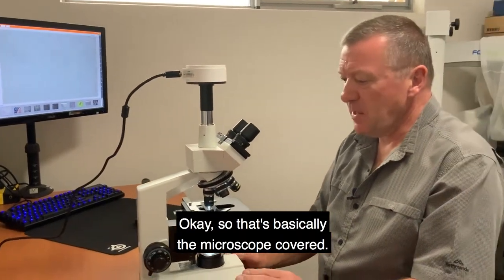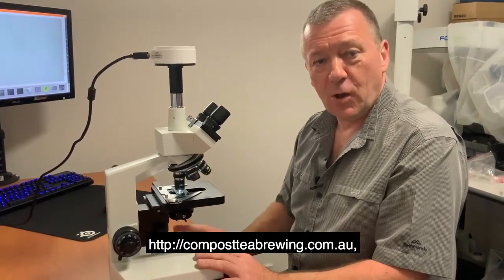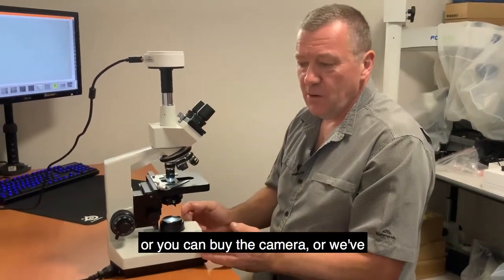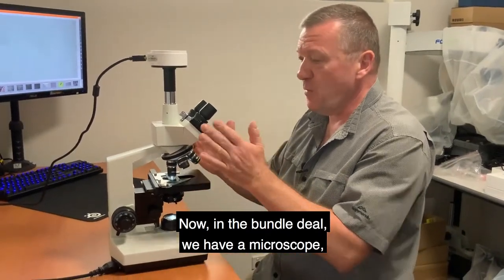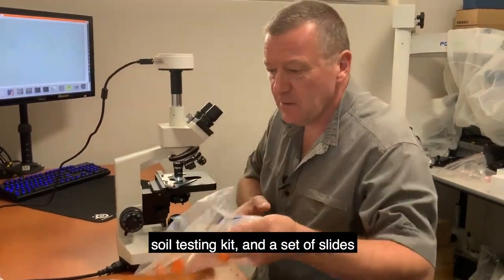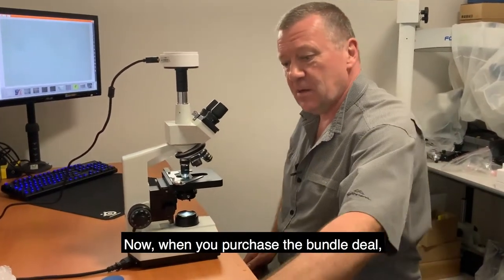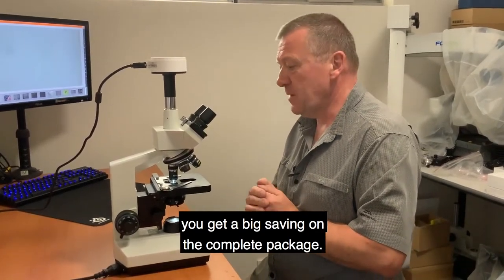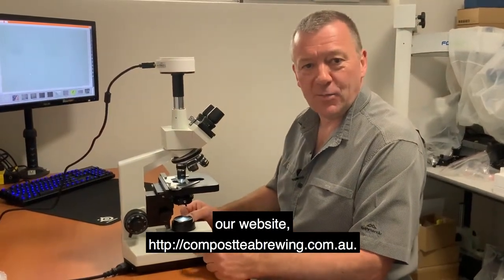That covers the microscope. On our website, compostteabrewingcompany.com.au, you can buy the microscope on its own, or add the camera, or choose our bundle deals. The bundle deal includes a microscope, camera, soil testing kit, a set of slides and cover slips, and a carry case — with a big saving on the complete package. For more information please visit our website. Thank you.